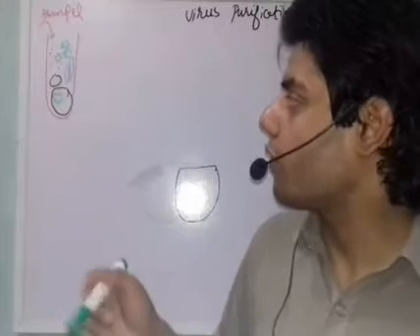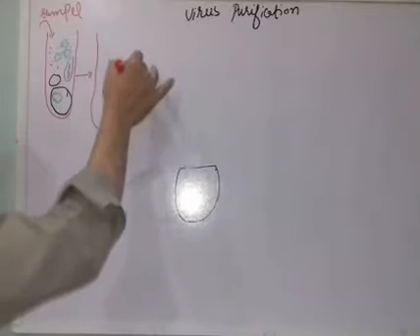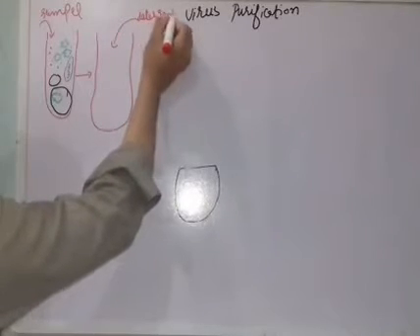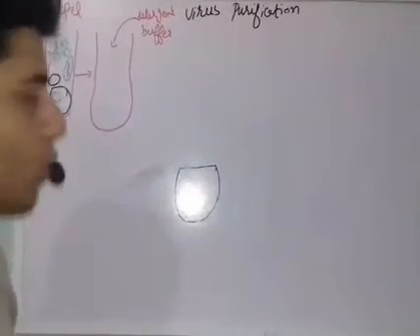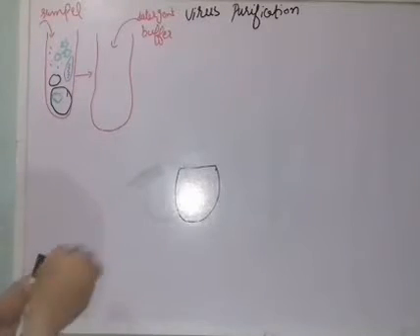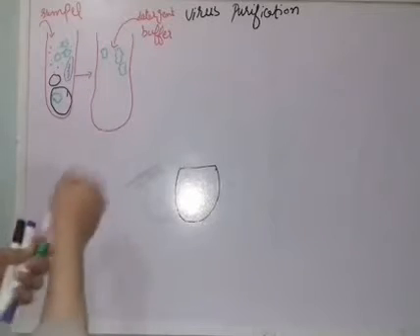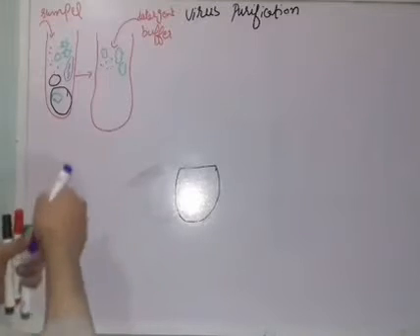Fine. So what we do after that, we put some detergent, or we put the buffer. So now what do the buffer and the detergent actually do? Once we load the buffer inside each tube, which contains the viruses, the ribosomes and protein, and also the mitochondria and other cell organelles.